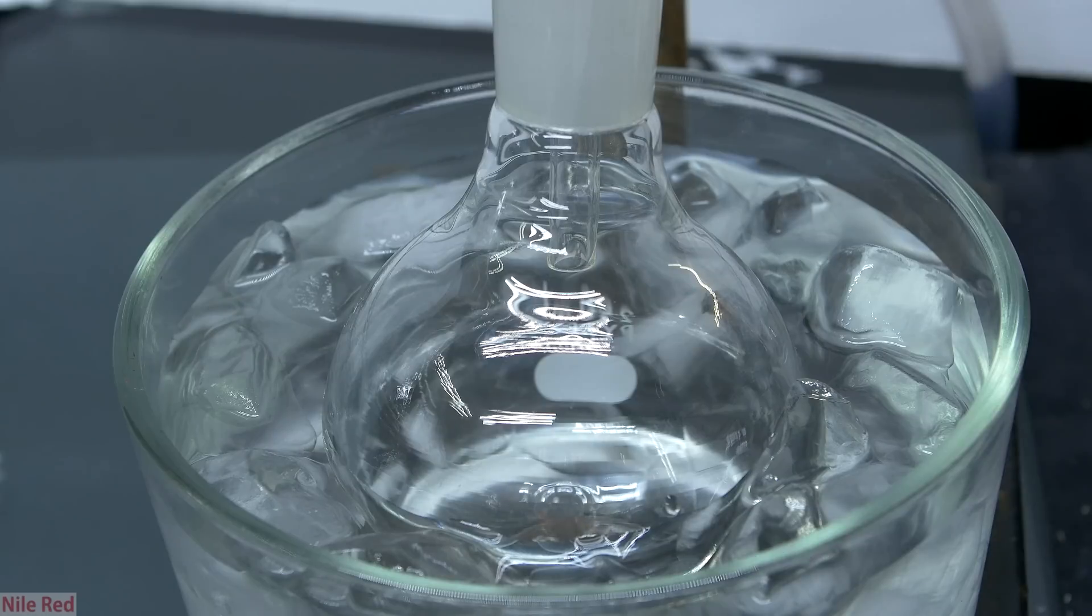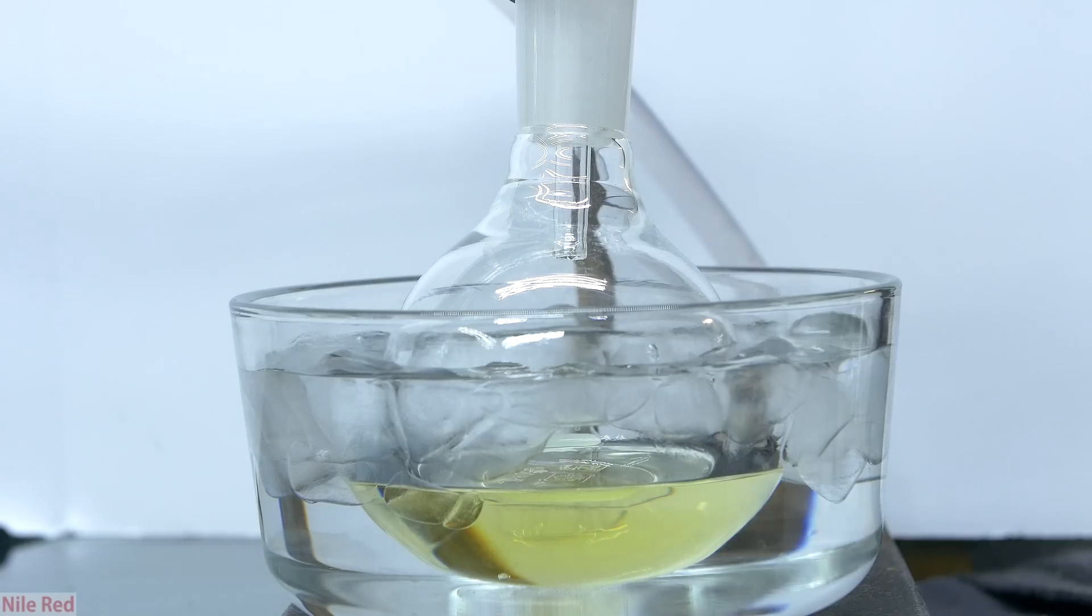When we look over at the receiving flask, we can see a very faintly yellow liquid coming over, and this is our methyl iodide which is contaminated with a little bit of iodine. You'll notice that the receiving flask is well cooled with an ice bath, and this is to limit the evaporation of the methyl iodide because it does have a pretty decently high vapor pressure.